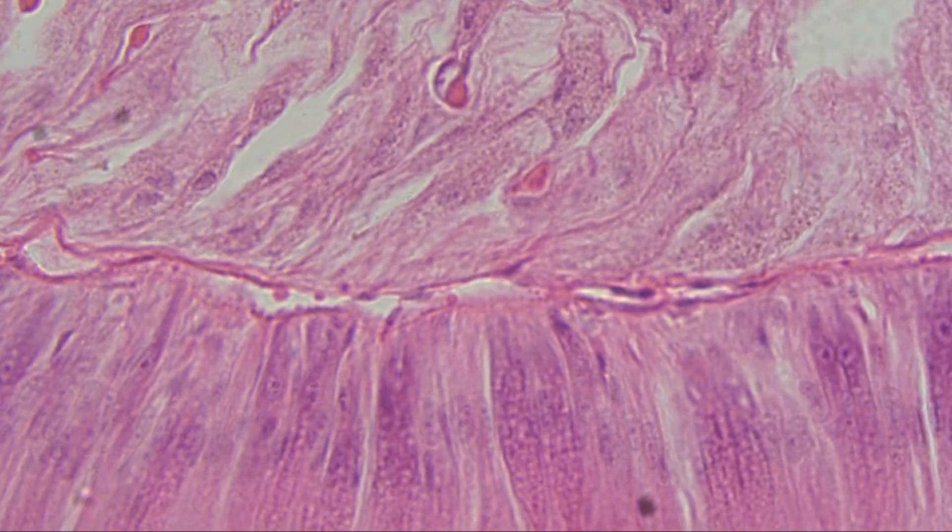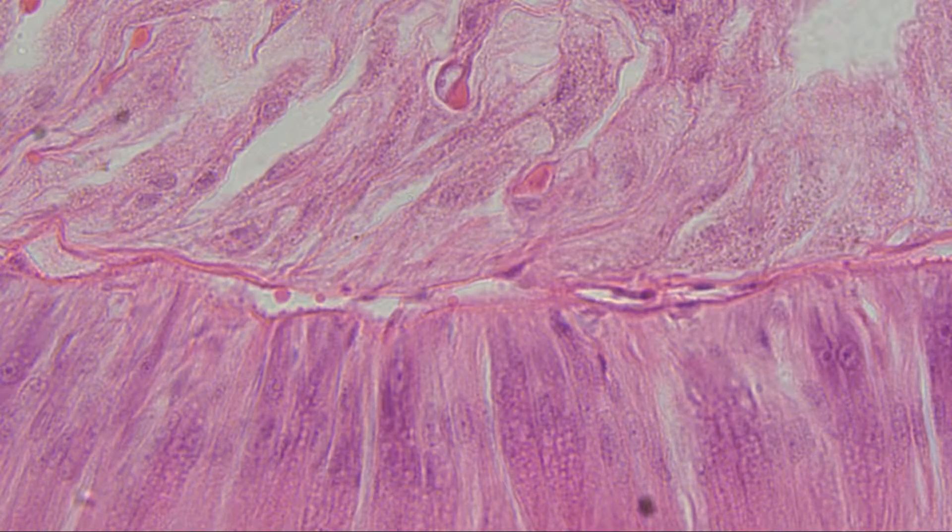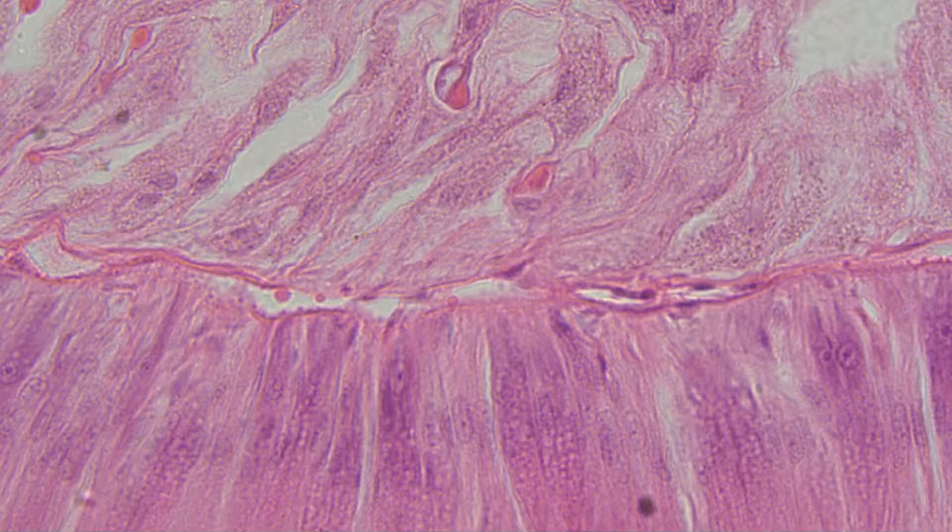This is a plan objective and you can see how it's in focus from the center all the way to the edge.